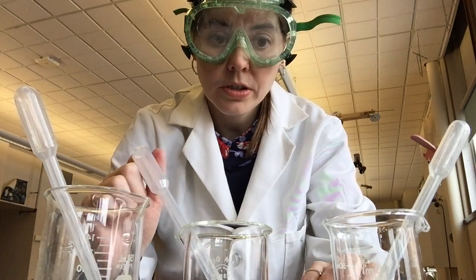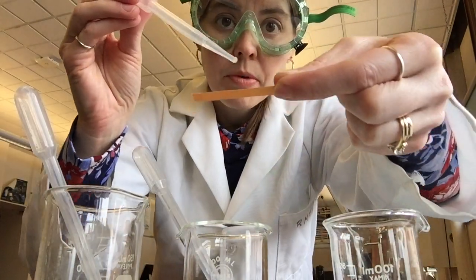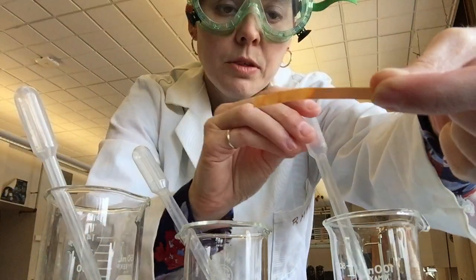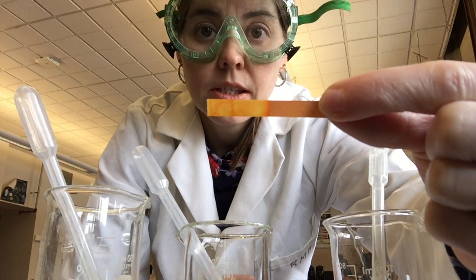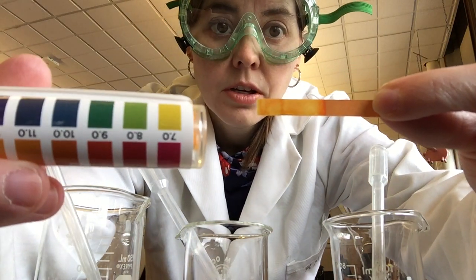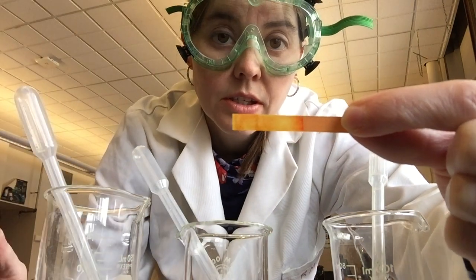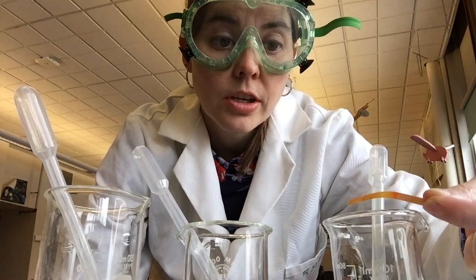I'll start with the first beaker and drop a small amount onto my litmus paper to see what color it is. This one is yellow — yellow is a 7, so it is neutral. This particular beaker is just plain water.